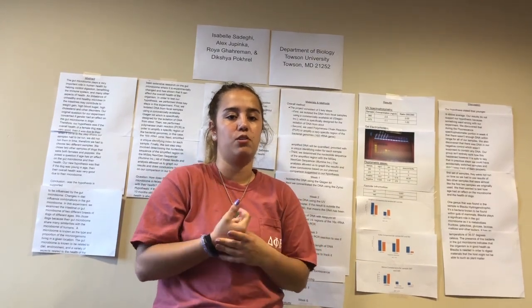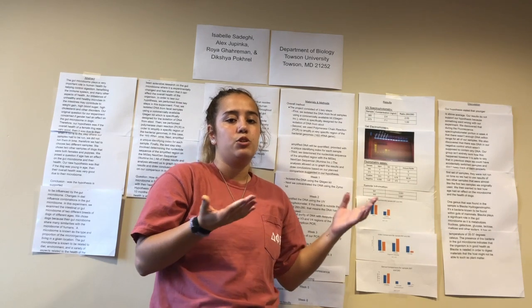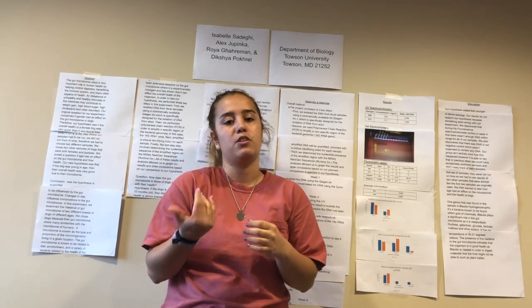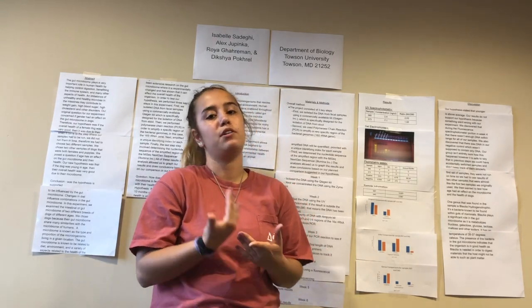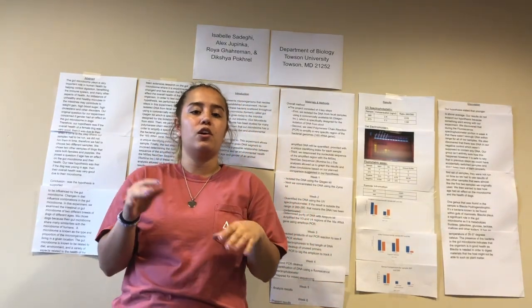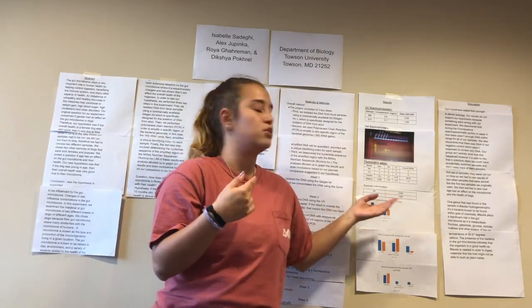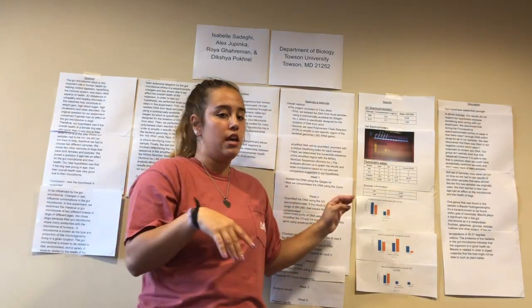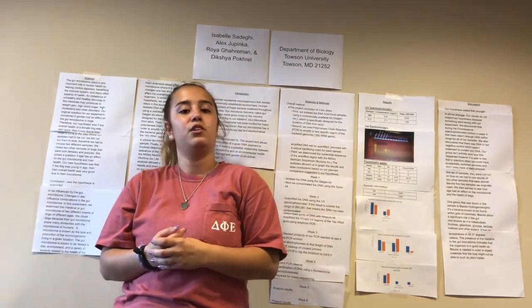So for our reads, the number of total and successful reads was that we needed to choose a different sample rather than the sample that we started with because the samples weren't run, and we chose samples 307 and 343. The number of total and successful reads of sample 307 was 3,223, and for sample 343 was 2,687.